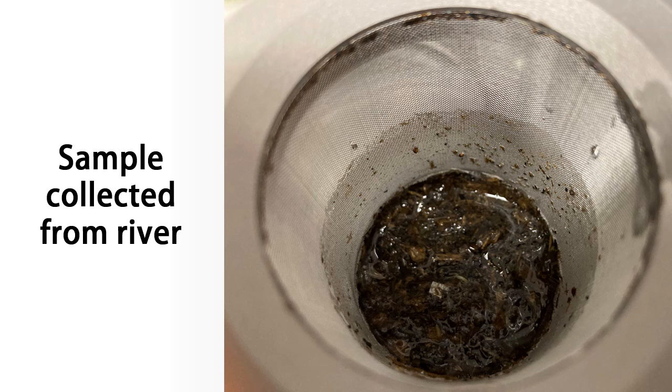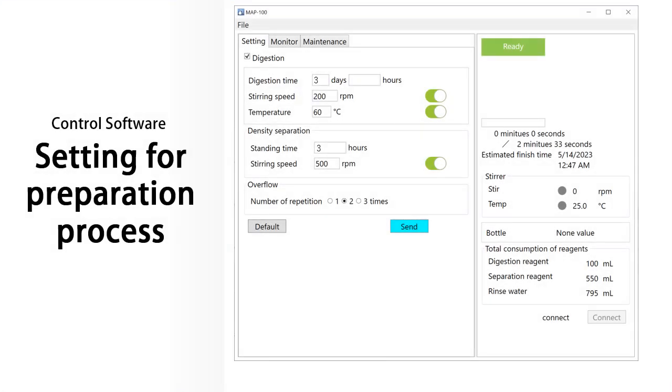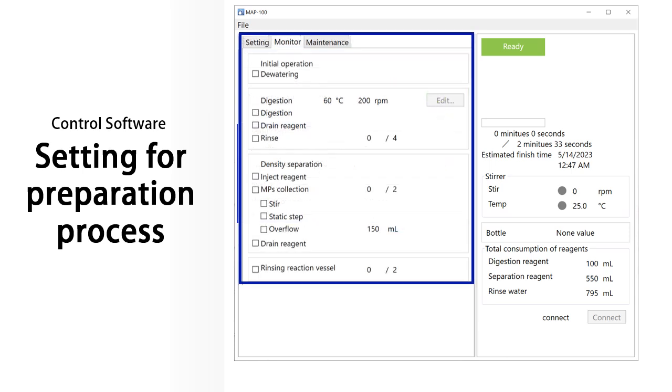This is a sample collected from a river in Okinawa. Microplastics are extracted from samples in this condition. The operation starts by setting the processing conditions using the MAP100 dedicated control software. You can easily set the time for each process and the number of times to repeat each process. You can check the progress of the process, and estimated completion times are also displayed, which is useful for planning experiments.